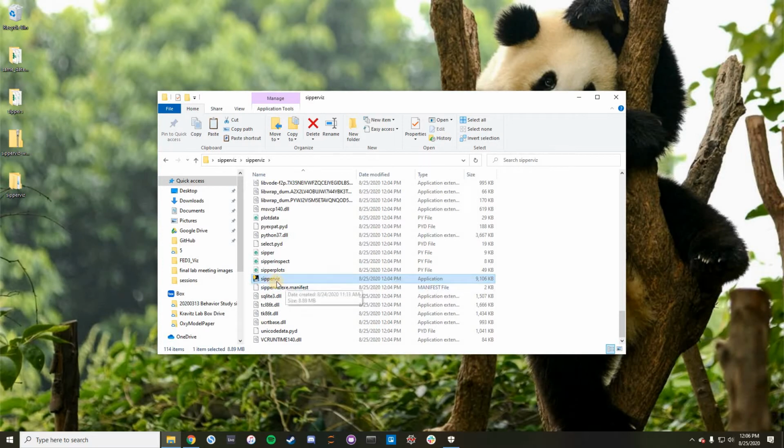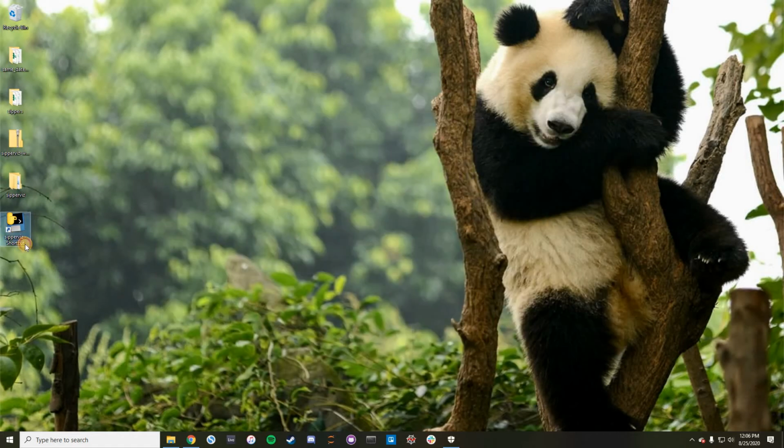So that's enough to double click and just run, but I'm going to do a couple extra things which will help. The first one is simple, just creating a shortcut. I'm just going to put that somewhere that's easier to access, so I don't have to deal with that folder anymore. And then the other thing I'm going to do is add an exclusion. I'm just going to basically tell Windows antivirus that I don't want you to scan this folder when I open the program. The reason for that is that doing the antivirus scan can slow everything down, particularly starting up the program. Windows doesn't know me as a developer, so it thinks that this could be malicious.